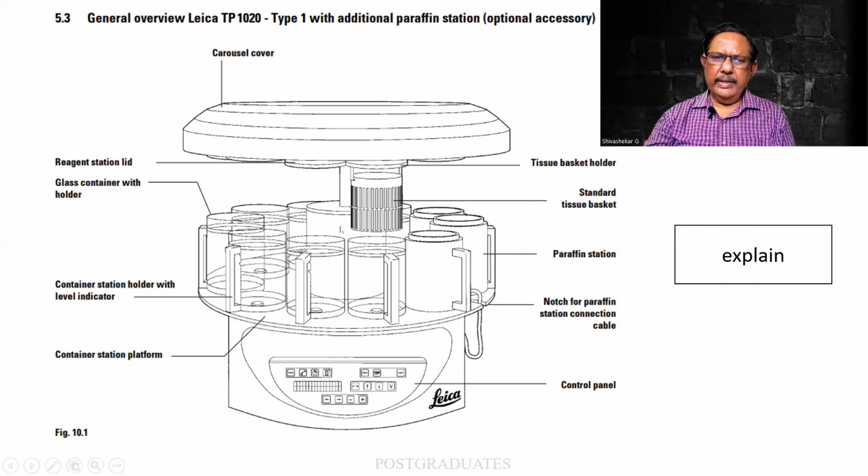And here again is the pivot. Pivot is the central pole that supports the entire thing. There will be the radiating arms which will be carrying the jar to the various containers. And in this case, it is a different format by which it has been programmed. I'm not seeing the master plate, and there is a little bit of sophistication that you can see in this. So this is the histokinette.